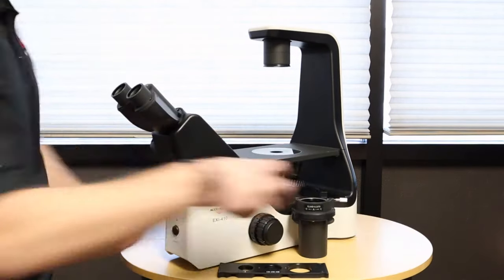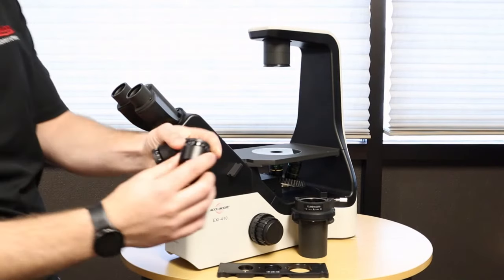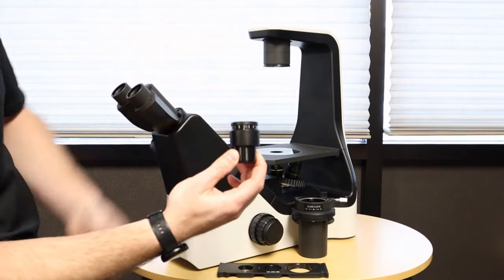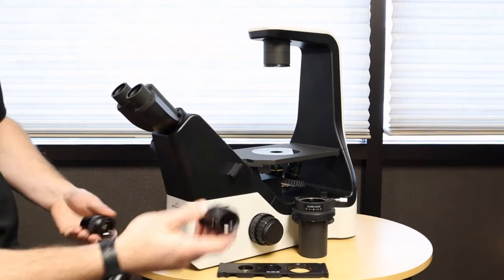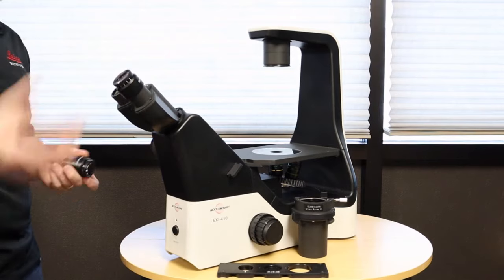Next we are going to install the eyepieces. It comes with two eyepieces, they are both focusing. So the first thing you want to know is make sure that you line the zero mark up with the dot, and very simply they get installed into the eye tubes.